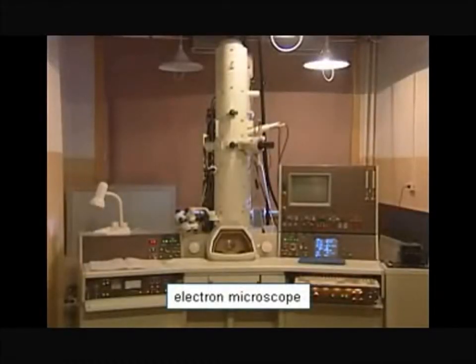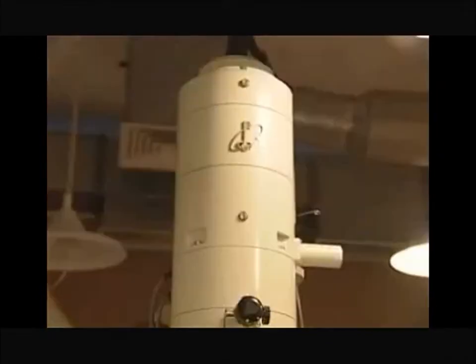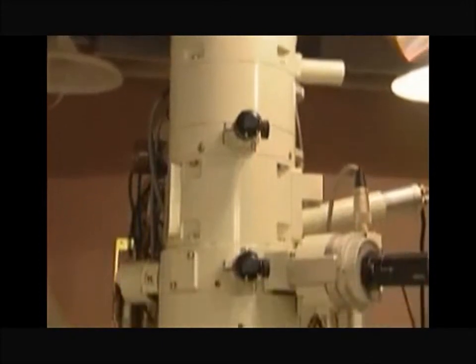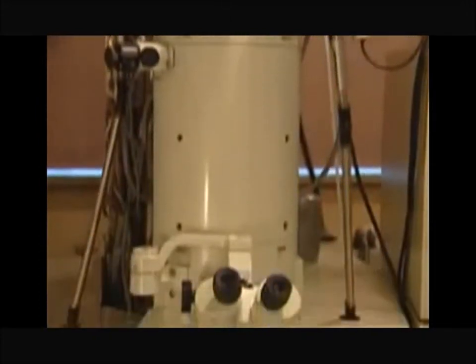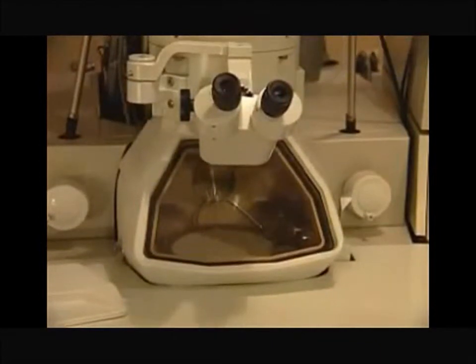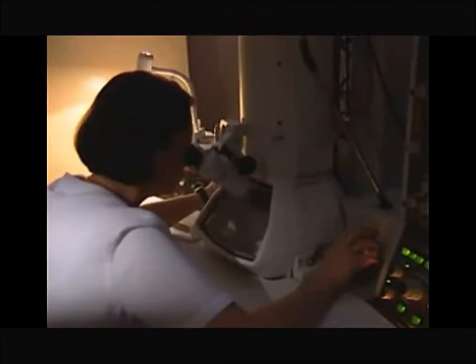The electron microscope consists of a cylindrical tube about 2 meters long, which is completely devoid of air. In contrast to the light microscope, the electron microscope visualizes objects using a thin beam of rapidly moving electrons that interact with the specimen placed in the tube.